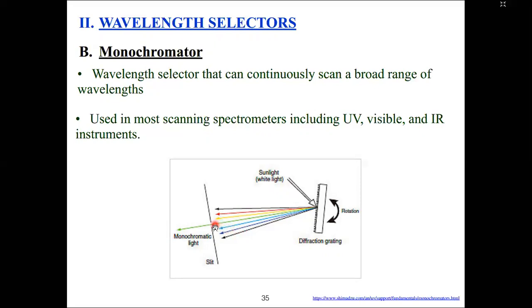However, once they are separated into the different colors, this is where our sample or the detector is located, which we'll be seeing, like I showed you during how the components are arranged. On this side, you will have, for example, the sample. Now you want to interact the sample with green light. Then what is going on? This diffraction grating, you can rotate it at a certain angle. So you rotate it in such a way that the wavelengths of the light will pass one at a time.